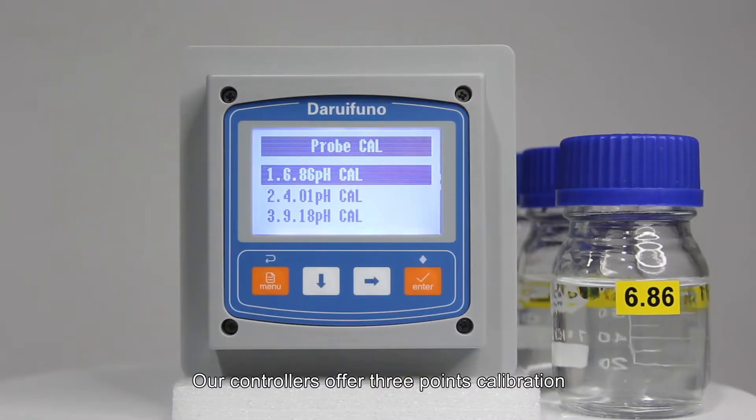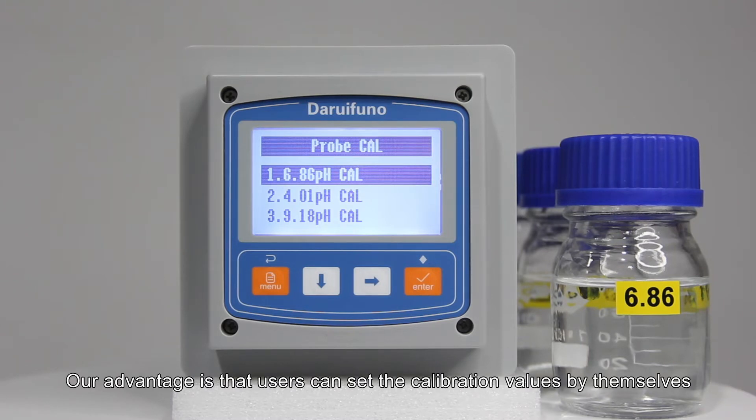Our controllers offer 3-point calibration: 6.86 pH, 4.01 pH, and 9.18 pH. Our advantage is that users can set the calibration values by themselves.